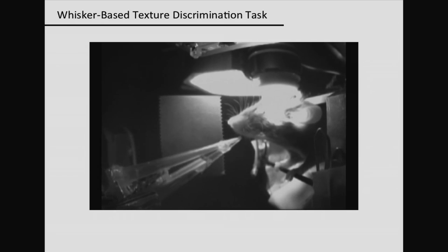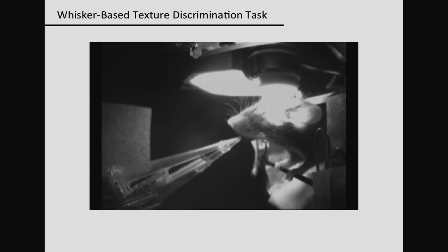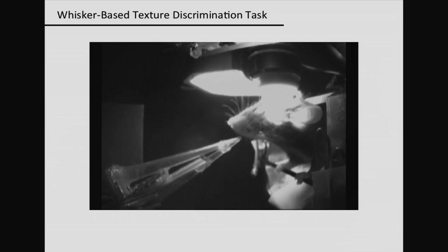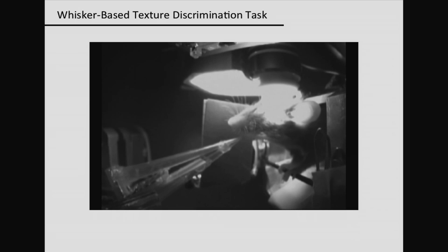And you can see the textures are being presented coming in from the left, and the animal will whisk and make its decision. So in this particular case, that was a rough texture, so it licked to obtain a water reward. This is a smooth sandpaper, so the animal will not lick and not respond.